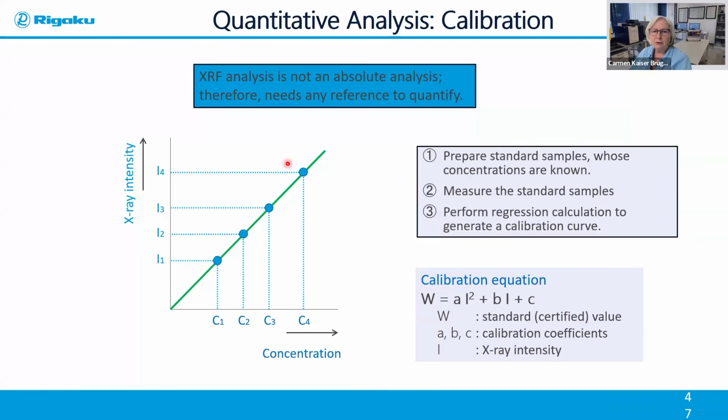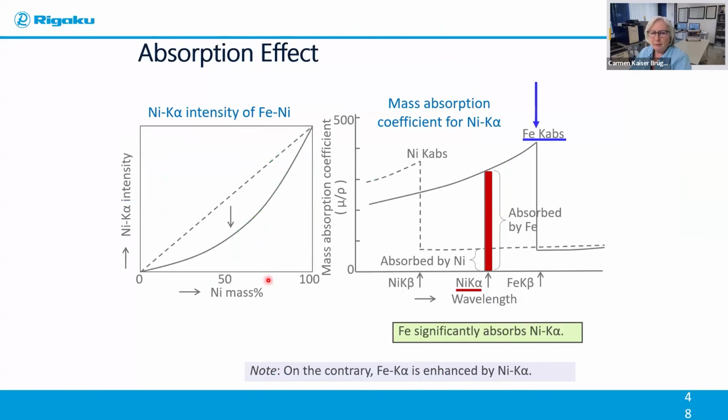Also important to have the correct range. And we should always remember that our calibration standards should be prepared in exactly the same way as our unknowns.